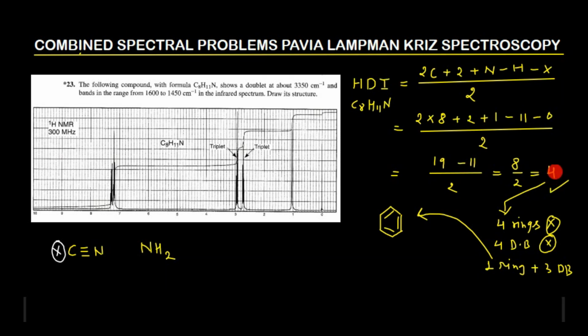6 or 7, you can calculate it, but it is only 4 here, right? So that means this cyanide is not there. And one more very important thing is that if cyanide was present in this particular compound, then definitely we would have the band in the IR spectrum which will resonate somewhere around 2260. So this is the range for the cyanide, 2260 to 2210 centimeter inverse, right?